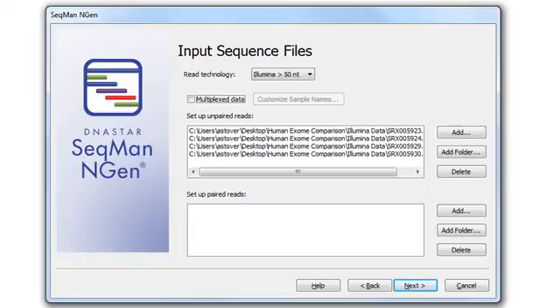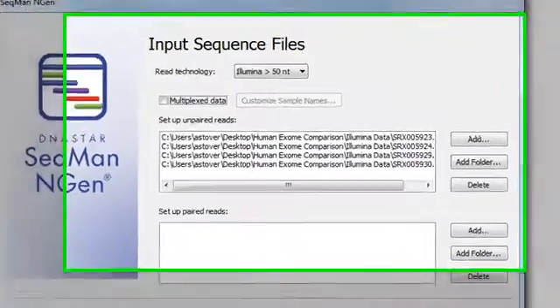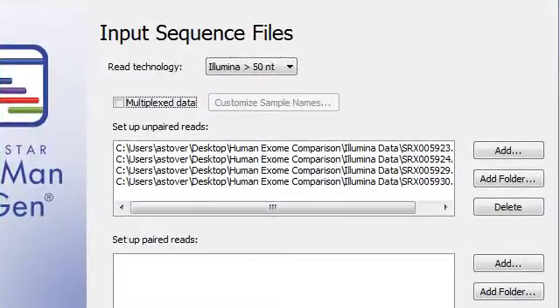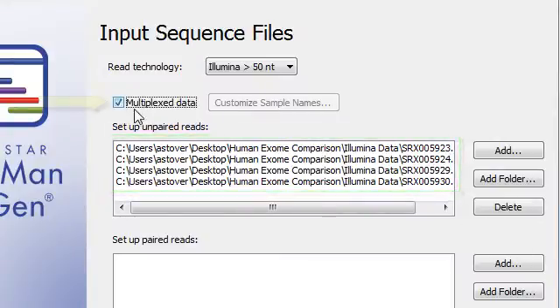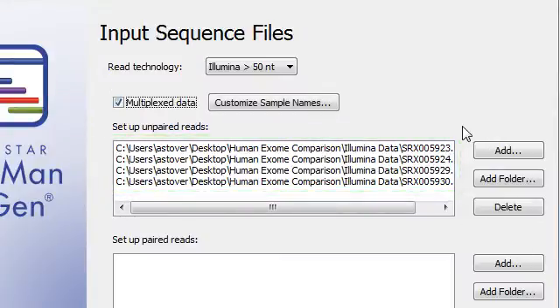To perform a large-scale multi-sample SNP analysis, the first step is to assemble your multiplex data in SeekMan Engine. To do this, set up your project as usual, but after adding your read files, check the multiplex data option. This will allow your data to be assembled as multiple samples.